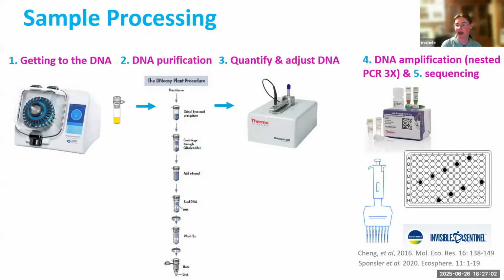Okay, so I'm going to try to not get too super techy here, but some of you might really be interested in the details, so I like to provide them when I can. Most of this process can be broken down into pretty finite sections. So obviously you're collecting the sample for me, I receive the sample, and I'm processing that sample to either make sure it's homogeneous or concentrating it to get at that pollen. Once I've got the amount of pollen I need, we have this amazing machine that takes the pollen collected from the honey or the pollen sample itself.